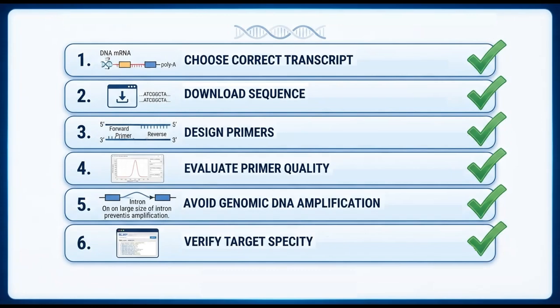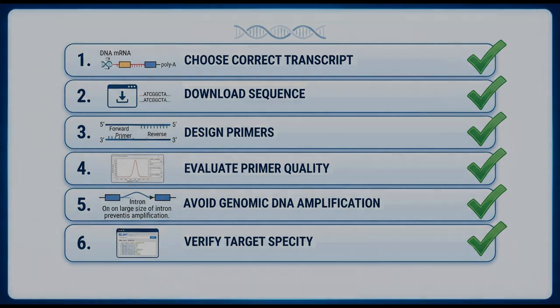By the end of this video, you'll know how to choose the correct transcript, download the right sequence, design high-quality primers, evaluate primer quality, avoid genomic DNA amplification, and verify that your primers amplify only your target gene.